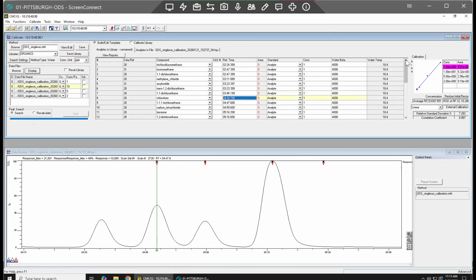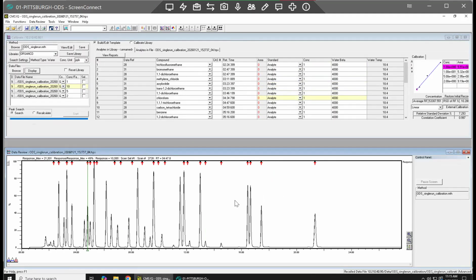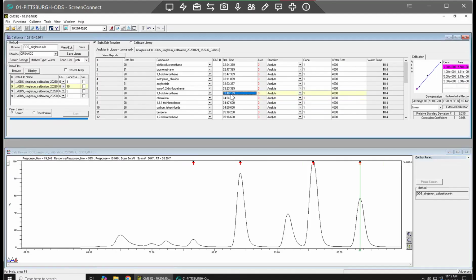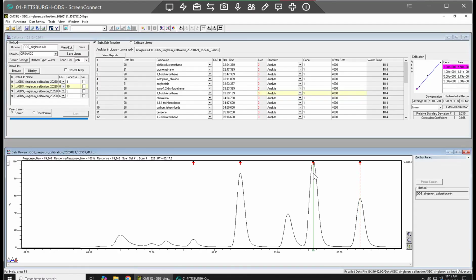Okay. So before chloroform, this one's definitely our solvent peak, so we know that's not an actual peak there. I'm still working backwards here, but I want to double check which of these co-elute. Bromomethane and 1,1-dichloroethene are co-eluters, and acrylonitrile and trans-1,2 look like they co-elute. Just wanting to make sure I don't change the wrong ones. So this one is 339, which was before chloroform. So let's make that 339. And then these two are going to be the same peak, so 317.